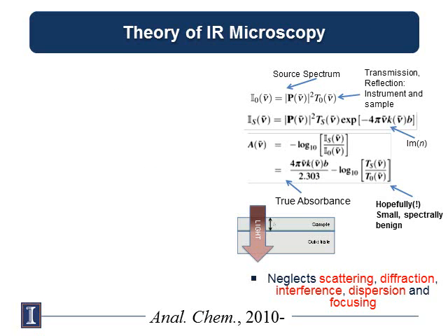And I'll give you a very, very simple equation. The fundamentals of IR spectroscopy in general are based on this. It says that the absorbance that you record is measured by the intensity that is transmitted with and without the sample. It's fairly trivial. This is Beer's law. It's been around for a long, long, long time. But what they don't tell you is that there's this little factor.